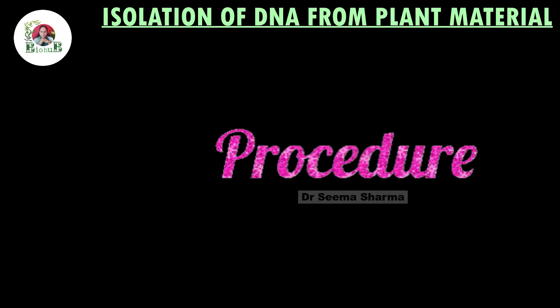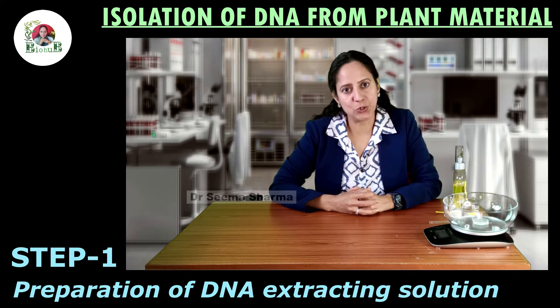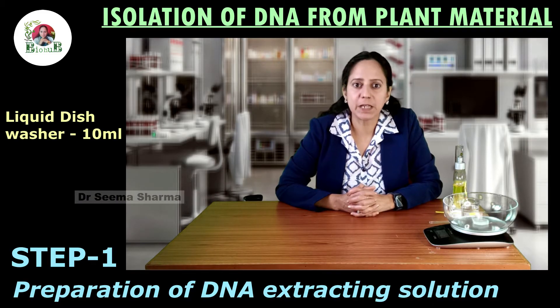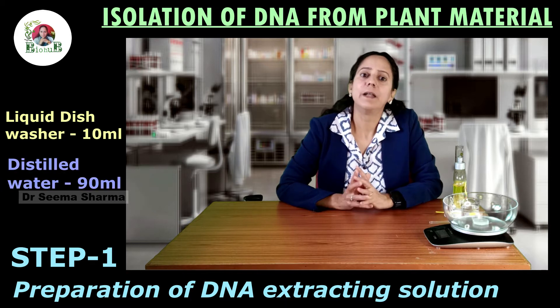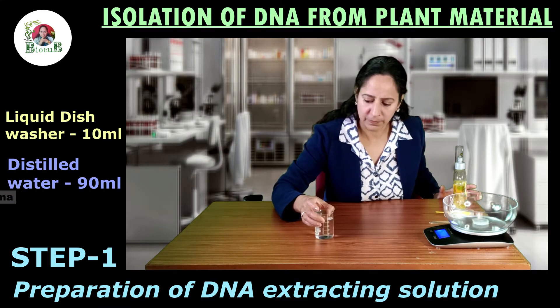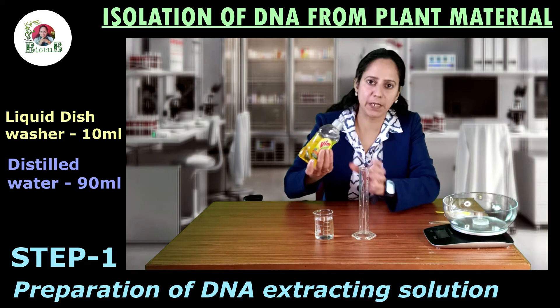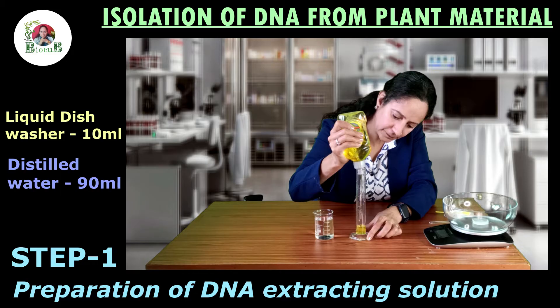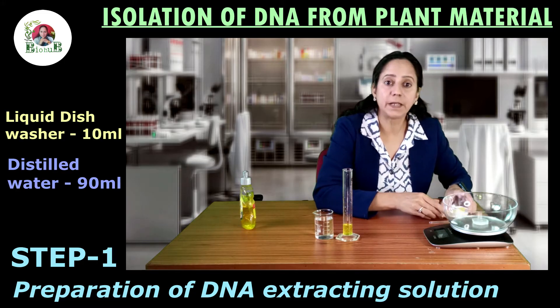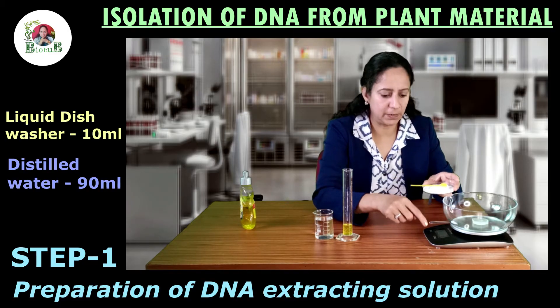Now, coming to procedures. Step 1: Preparation of DNA extracting solution. For this, we need 10 grams of sodium chloride, 10 ml of liquid dishwasher, and 90 ml of distilled water. Here is 90 ml of distilled water in the measuring cylinder. I am pouring 10 ml of liquid detergent in it. Now we need to weigh 10 grams of sodium chloride on the weighing machine.